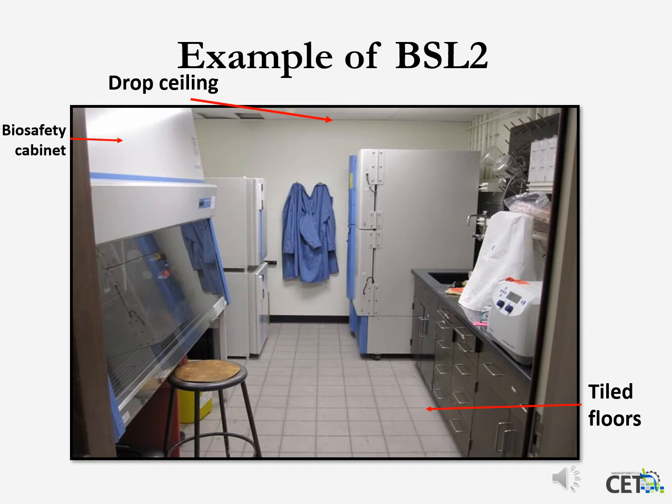It is separated from the public. It has controlled access. That means that the door will be locked, but you can get in with a key code or a card. Sometimes you have to buzz in. The ventilation in these labs can be different. It doesn't have to be.